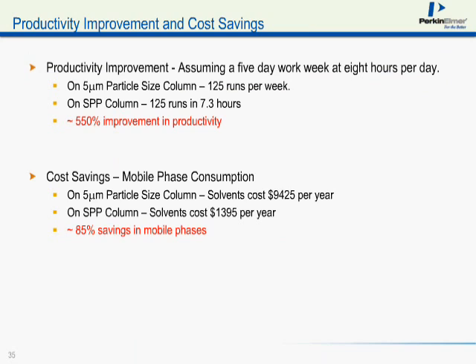And that does not take into consideration the disposal of your chemicals. Oftentimes it costs more to dispose of the chemicals than it does to purchase them originally. And so as you can see, with a simple isocratic method, the basic steps are, once you've chosen the method that you want to transfer, to determine the correct column. And once you determine the correct column, you can use the calculator or the white paper to calculate your new injection volumes and flow rates. And then it's simply a matter of changing those parameters on your LC system, running some test injections, and then optimizing for that particular sample.